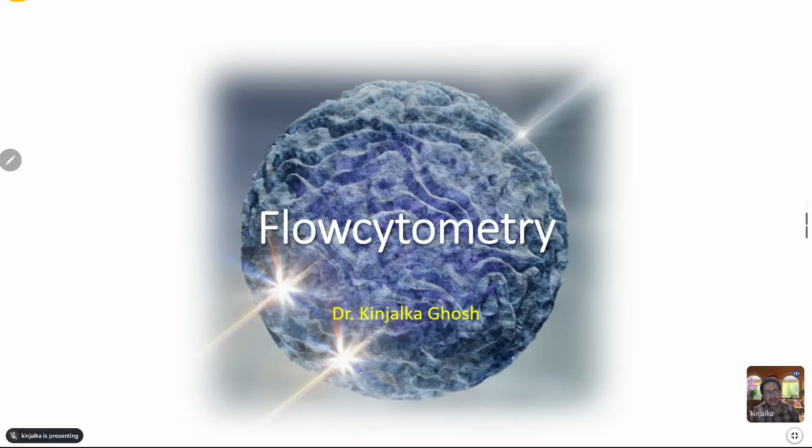on the cell surface or inside the cell. One major limitation is that it cannot identify secreted things. And I mean, like the image you see here, this is basically a cell, right?